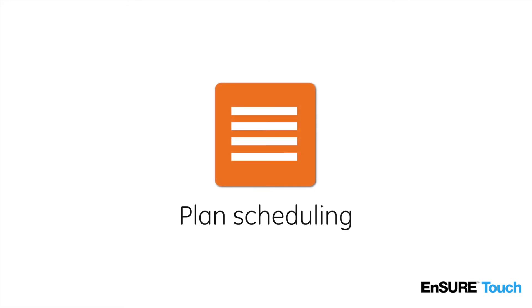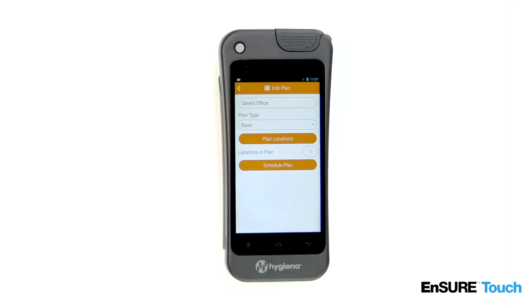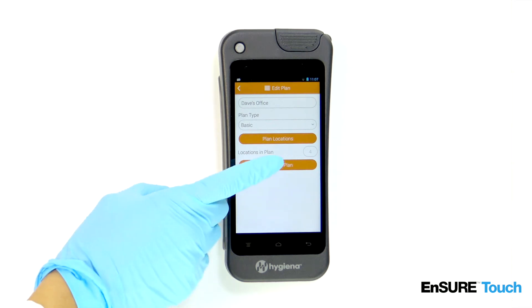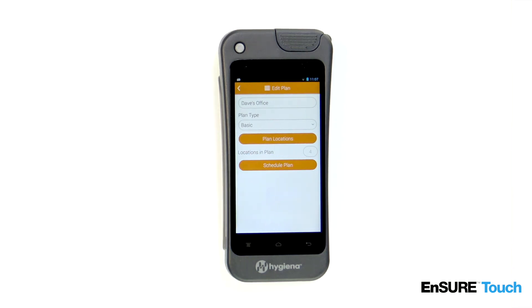Remembering to perform the right plans can be a hassle. That's why we've made it easy for you to remember with plan scheduling. To schedule a plan, touch the schedule plan button.